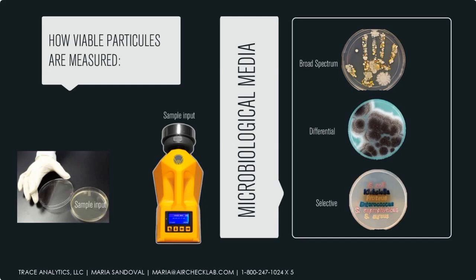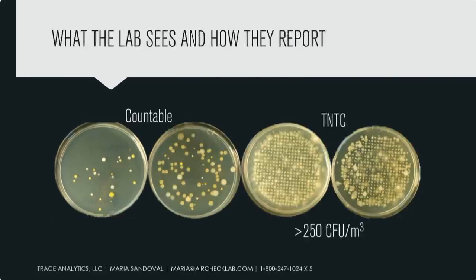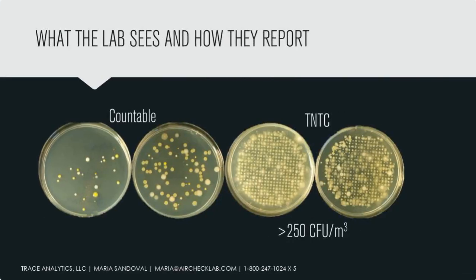And those are the types of microbiological media that are available for contact plates. They're available for ambient air, compressed air, water sampling, clothing testing, all of that. So these are the different types of media. When the lab puts it in an incubator, which is a glorified oven, it's at a set temperature that makes these organisms happy.